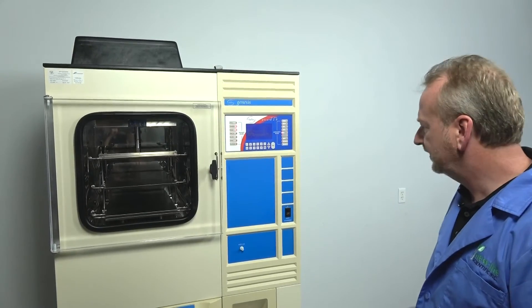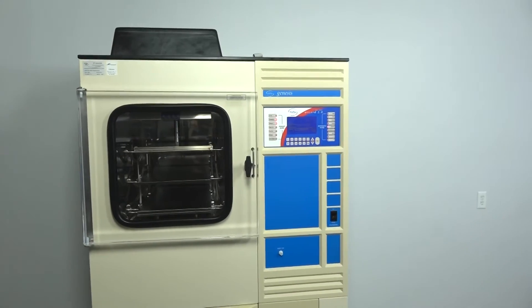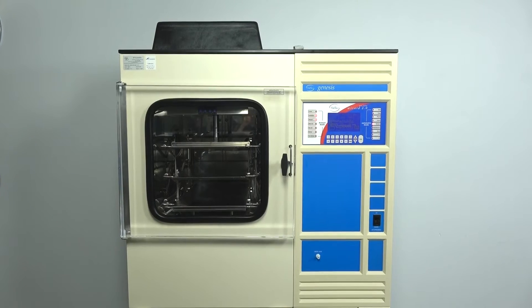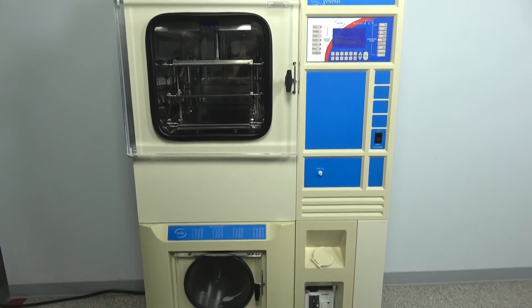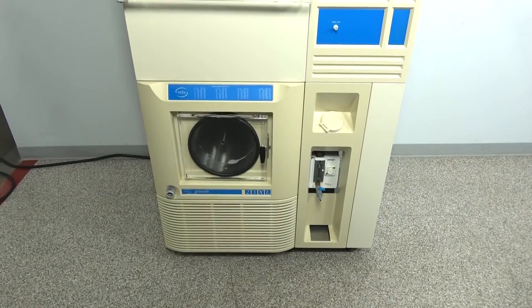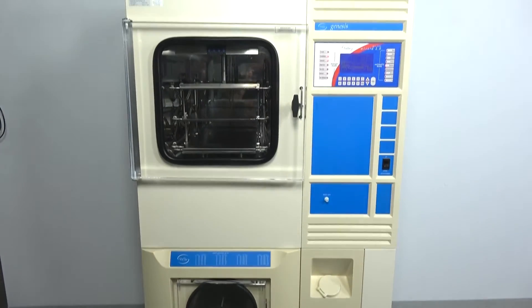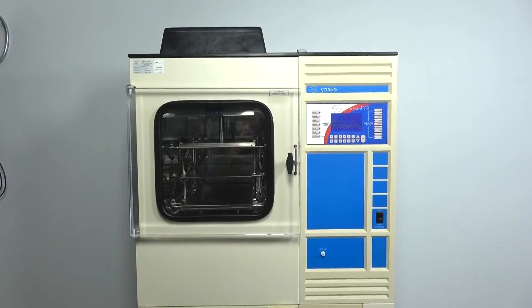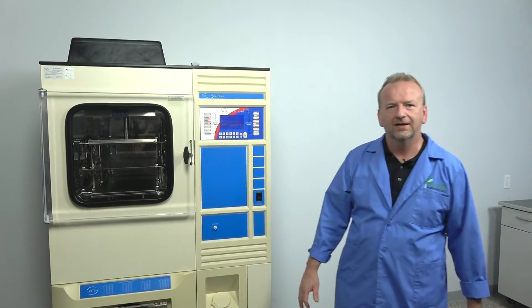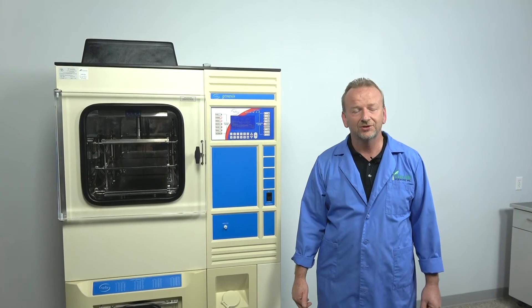We're really accustomed to these machines and we deal in bench top models and upright Genesis units — we're very experienced with them. We have a lot of spare parts and different things we offer even with these, so we're here to help. We just wanted to show you that this is a machine in excellent condition, ready to go to work for you. If you've got any questions, I'm here at New Life Scientific. This is Rich — I appreciate you watching.